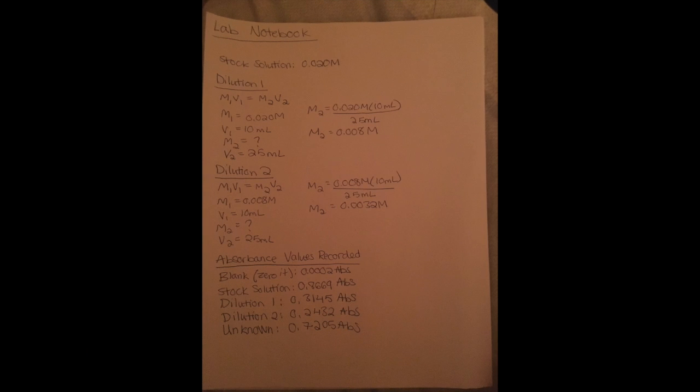Now that we have all of the absorbance readings of our samples and the molarities that we calculated when making the dilutions, we can now use Beer-Lambert's law to find the concentration of the unknown. Oh boy, do we love spectrophotometry!